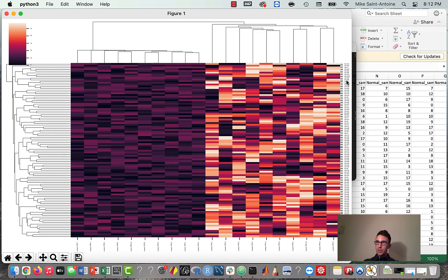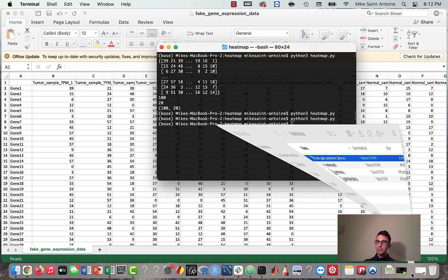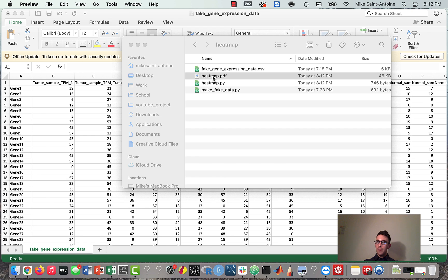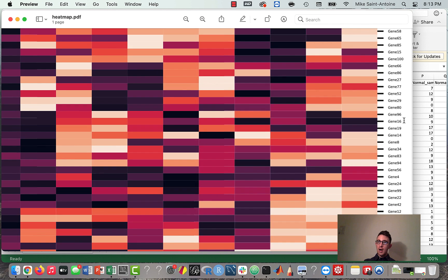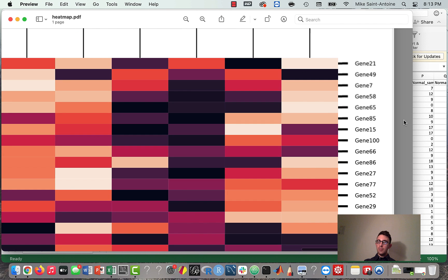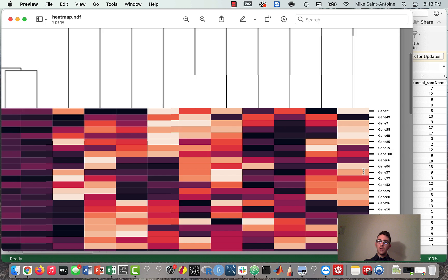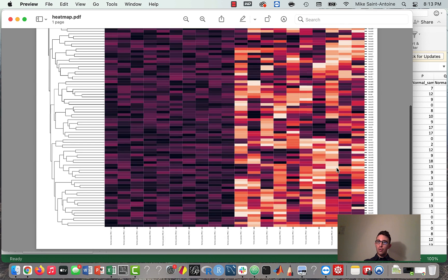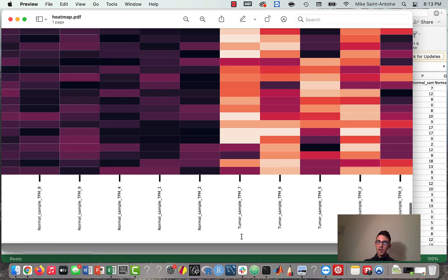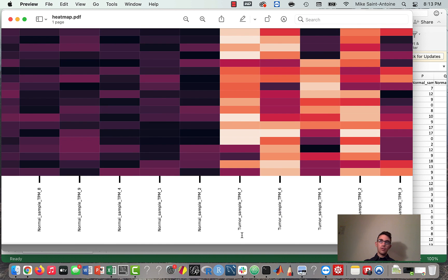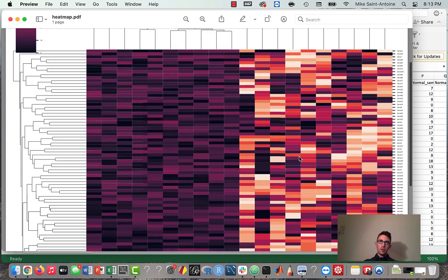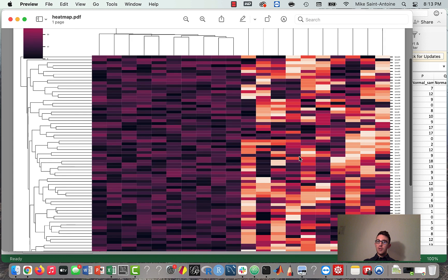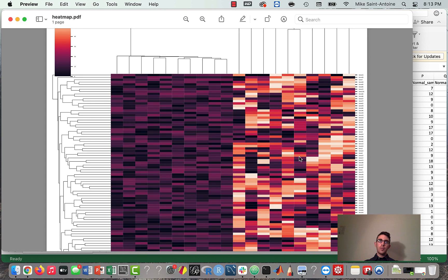Okay, that's better. I know it looks small, but we have to make it small so it's not all jumbled together. When you open the PDF, it's high enough resolution that you can zoom in and see everything. This is the figure we just generated with our code — very nice. Seaborn does a good job making very clean-looking figures. If you're going into bioinformatics or computational biology, this is probably one of the most common types of figures you're going to run into, both to look at and to generate yourself.